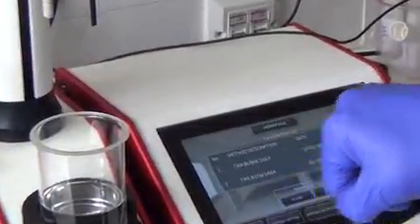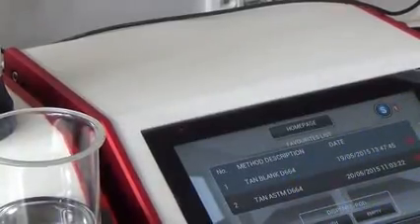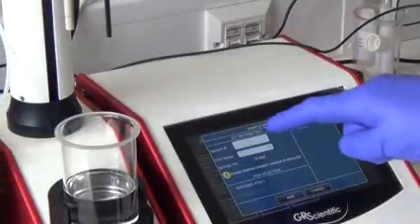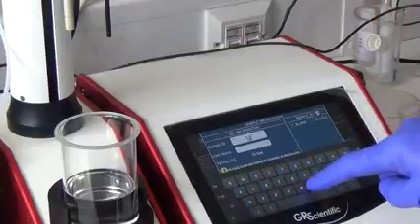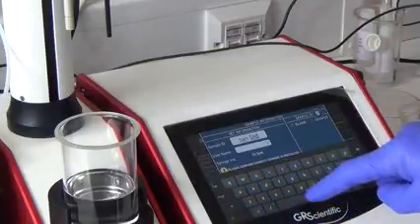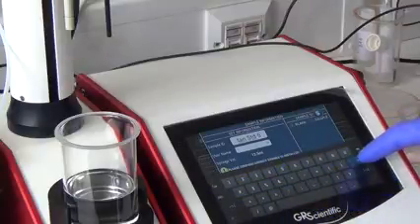So from the homepage, this is one of our favorite methods. As you can see, method number two. Sample information page. So we're going to enter our sample ID. I'm just going to call it TAN standard 5. Enter that.